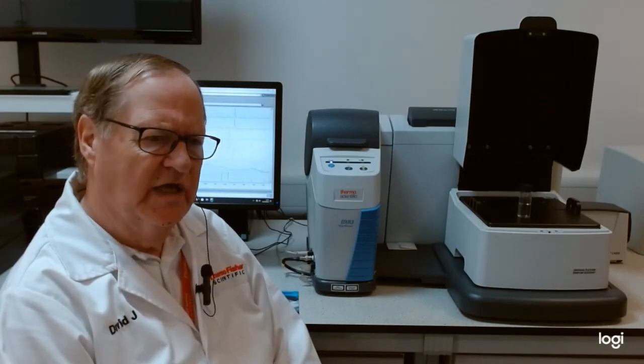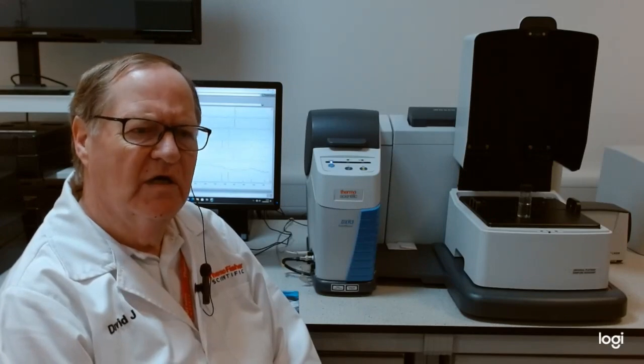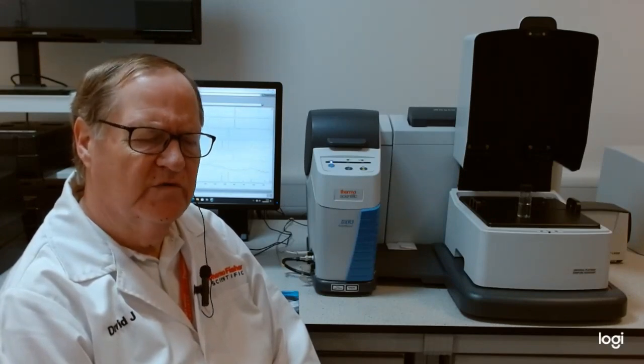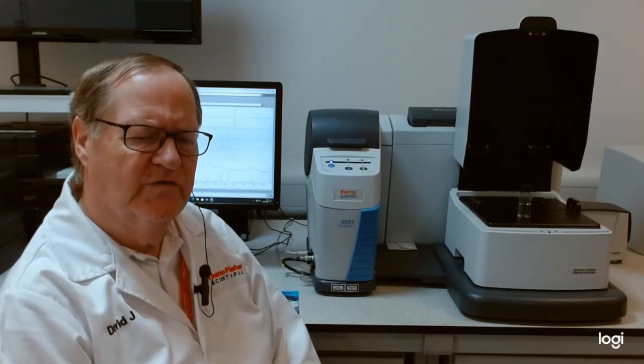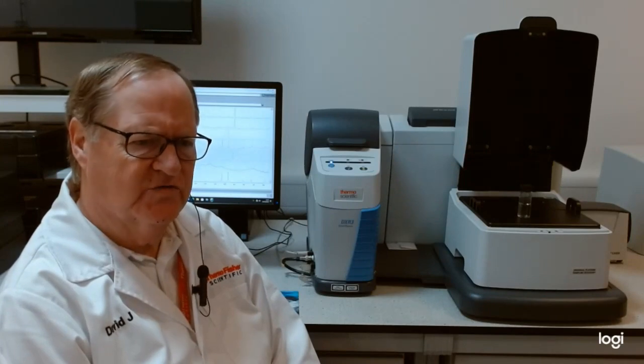The motorized system takes standard 96-well plates so that you can perform, for example, characterization of polymorphs, or any form of associative analysis compared to, for example, X-ray work.